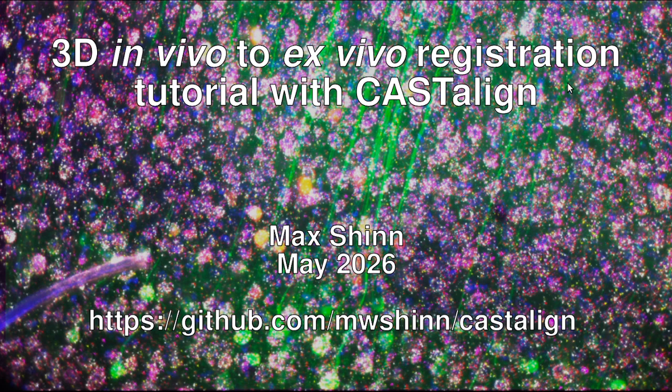Okay, welcome to this tutorial on how to register in vivo to ex vivo images for systems neuroscience. We're going to go through how to register a bunch of microscopy images to each other using this tool called CASTalign.